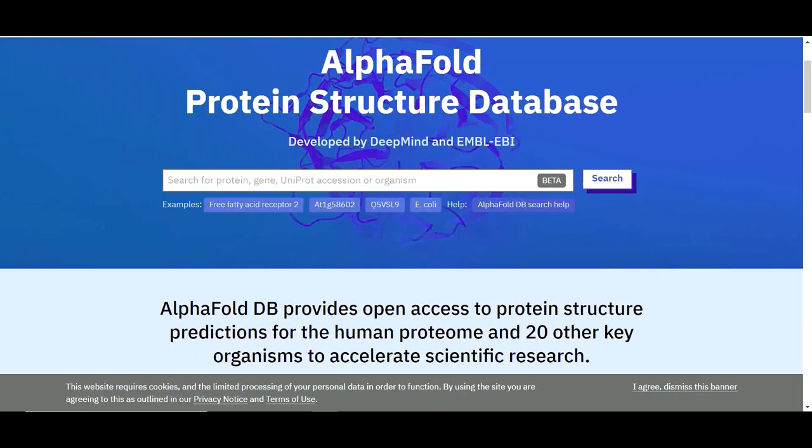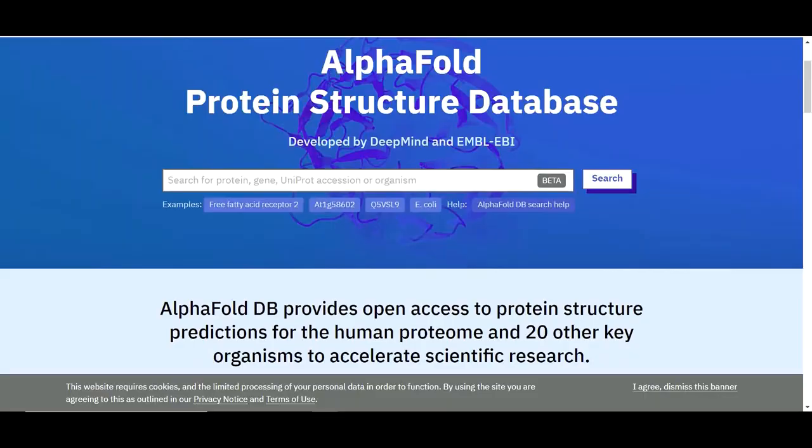Let's try to understand how to search this database. You can search this database by using the protein name, gene name, UniProt ID, or the organism name. For instance, if you don't have any idea about the protein name, gene name, or UniProt ID, you can still search this database by using a protein sequence. Now to search by protein sequence, you need to use a third-party tool.